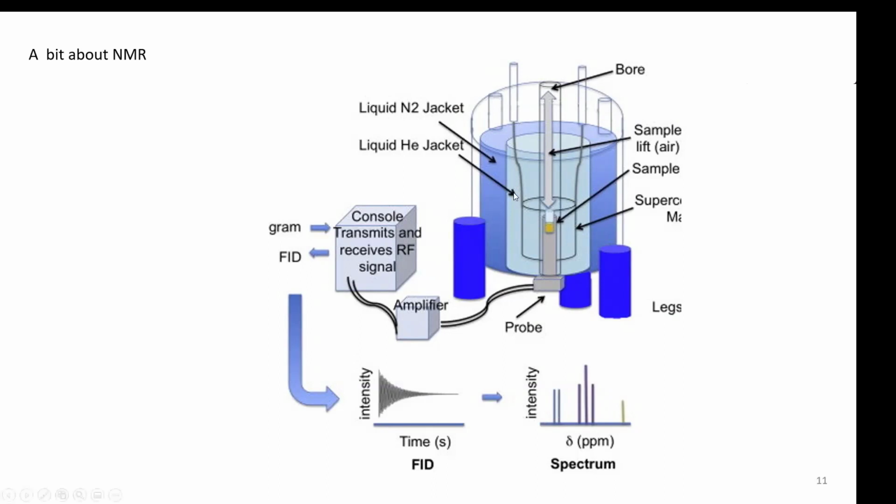So that's extremely low. At the extremely low temperature, the electric current applied into your sample will create a pulse of a magnetic field. So when that magnetic field is created around your sample, the magnets inside the sample, that's usually caused by the proton, feel that external field and all align up to one direction.